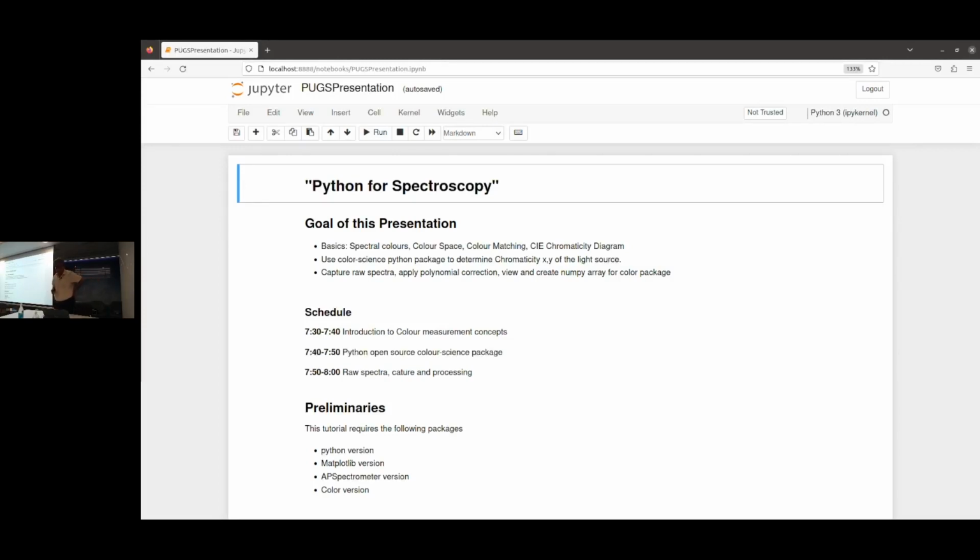I'm Rajan. My background is in electronics and hardware, as you heard. But today's talk is perhaps closer to scientific Python. In a way, I've been a paper reviewer for that conference. That was a volunteer thing. Today, I strive to interest you in color measurement, or exploring color using Python.